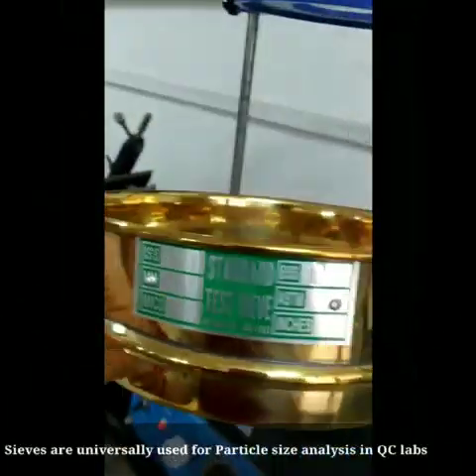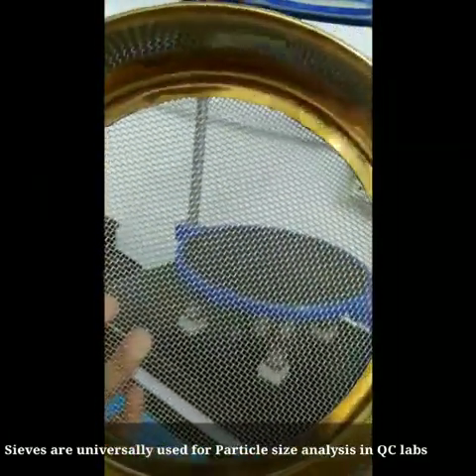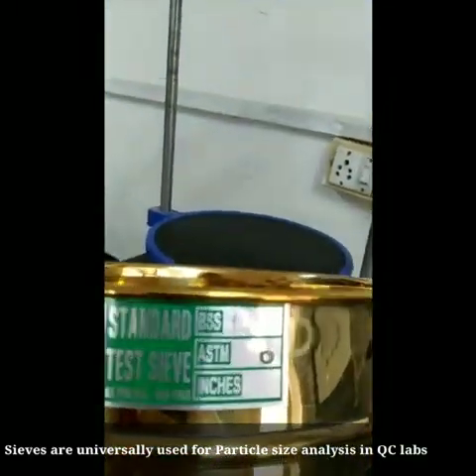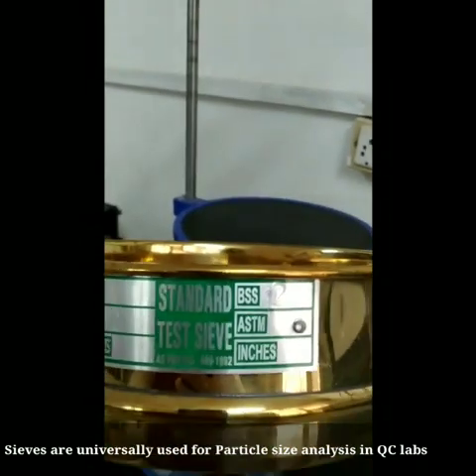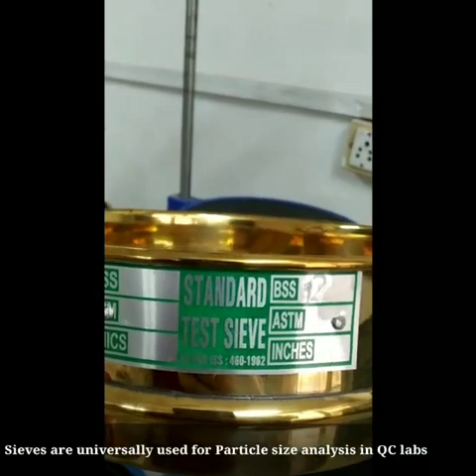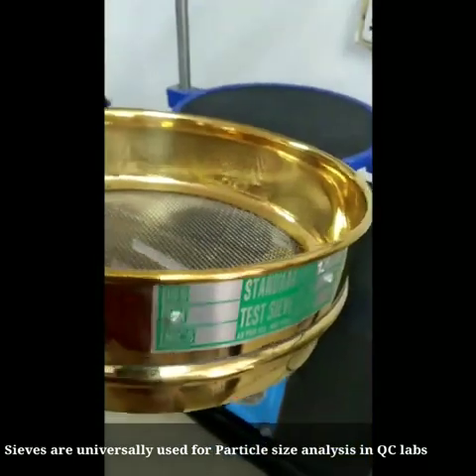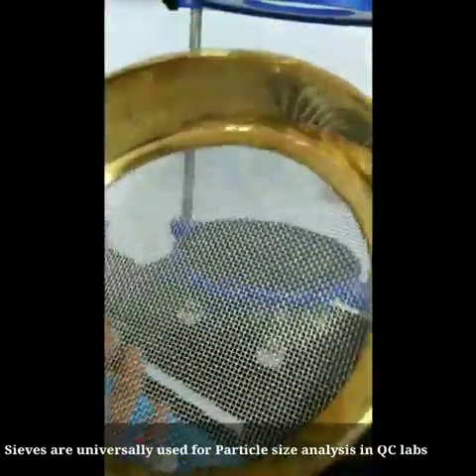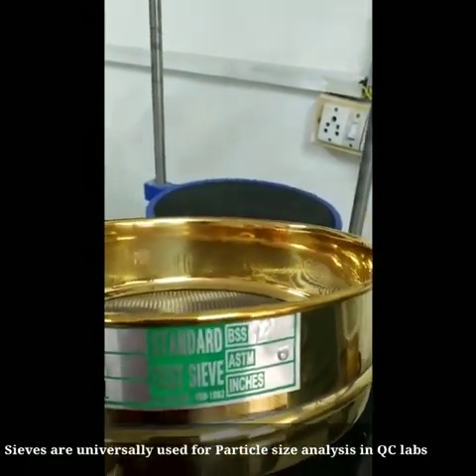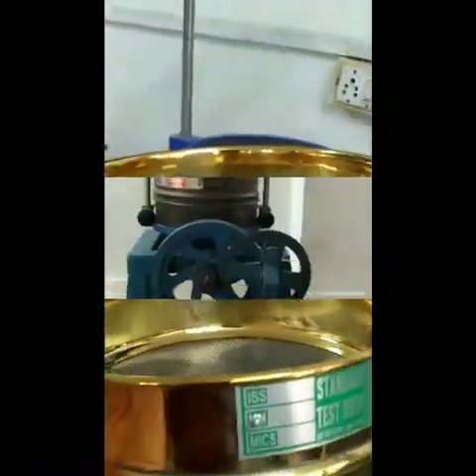This is a standard test sieve. Here it is written BSS, which stands for British Standard Sieve. ASTM stands for American Society for Testing and Materials — it is an ASTM graded sieve. Here we can see these are the apertures; these are not simple sieves. They are accredited by BSS or ASTM, and only this type of sieve is used for analyzing particle size.